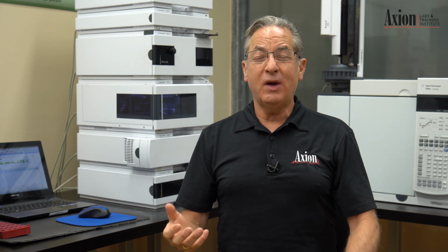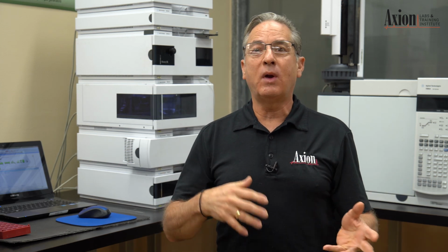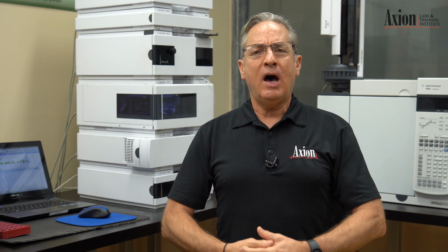So if you think back to some of the other webinars that we've done, in the one where we did aspirin tablets, there was a lot more sample prep because we had dissolution, we had filtering, we had to figure out the right solvent for dissolution and the right amount of time and sonication. And then we did the webinar on soft drinks, and that was pretty simple. We just take a can of Coke, open it up, and pull some sample out and put it right in the vial.